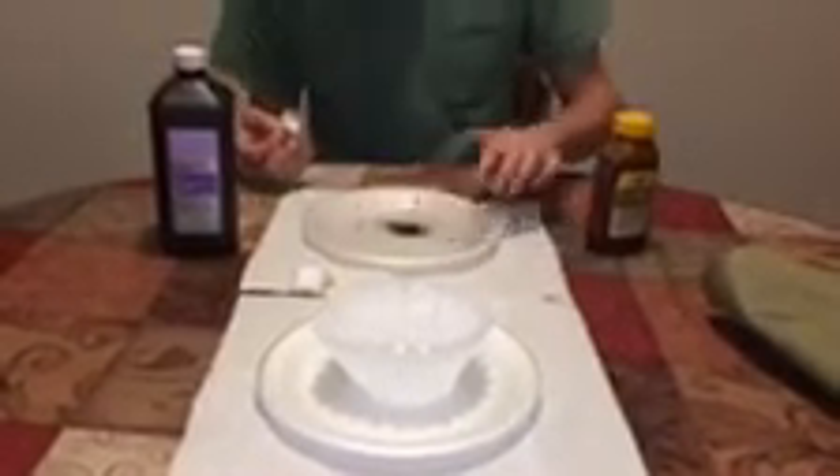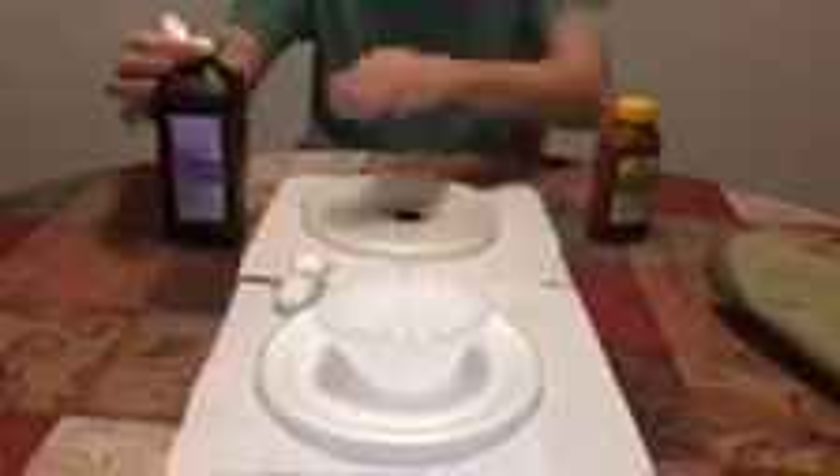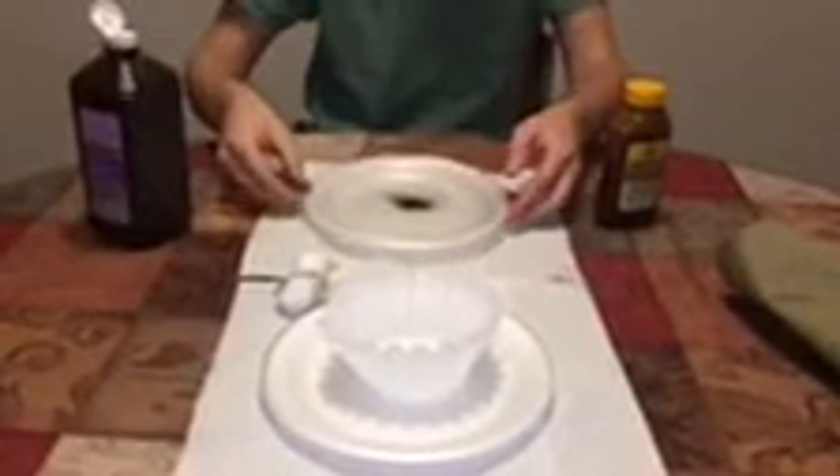Once you got that on there, you put your hydrogen peroxide onto this. Can you zoom in? Can you get closer? Just bring it closer. If you look really closely, you can see it flaking up. See it right there, see it right on the top.